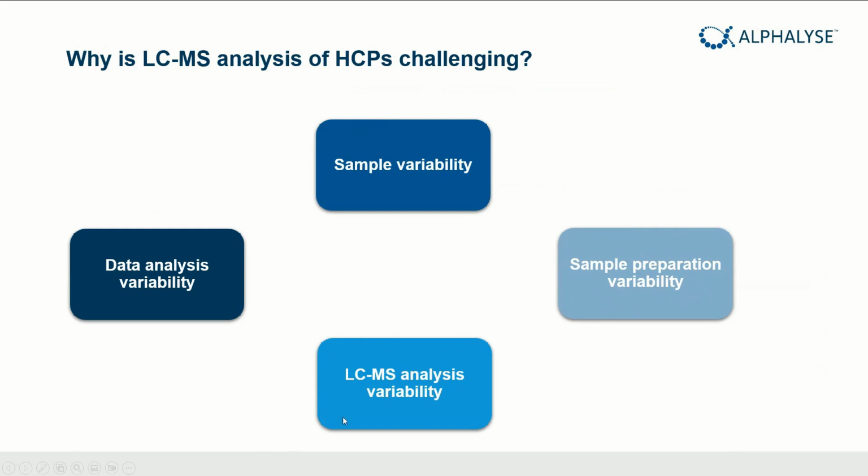The third variability comes from the LC-MS analysis. So this could be choice of column performance, injection volume, column temperature, mobile phases, and then you have the MS performance. This could be peak picking, MS signal integration, protein identification criteria, protein quantification algorithm, and this also adds up to the data analysis variability that it is very complex.